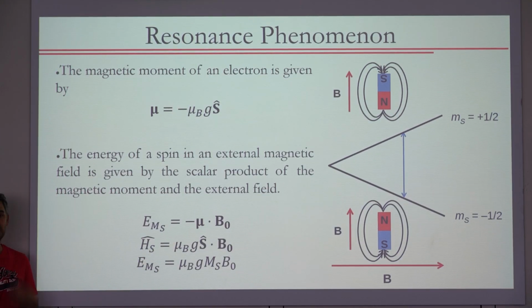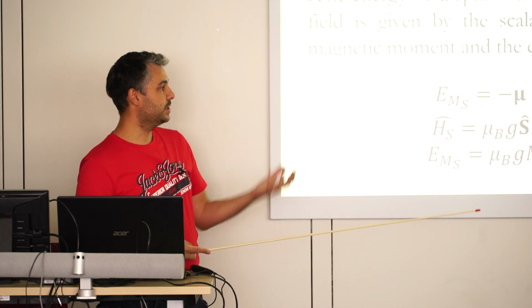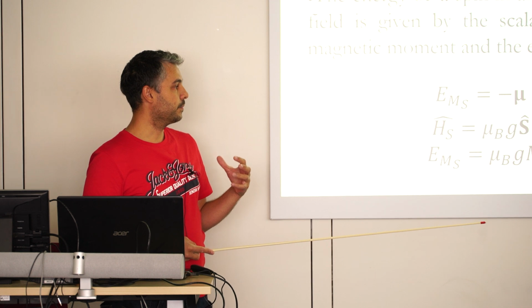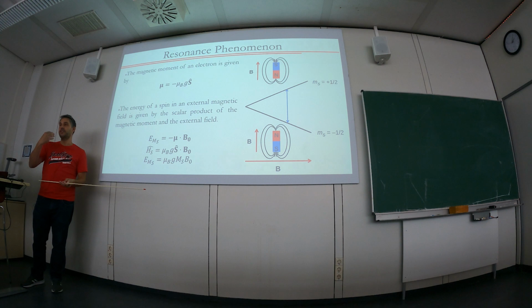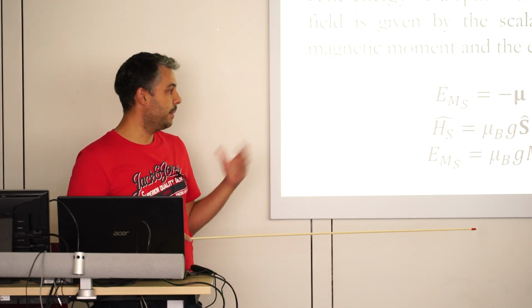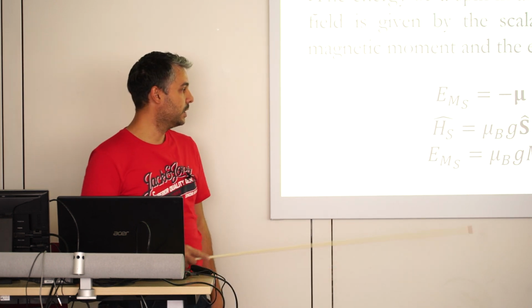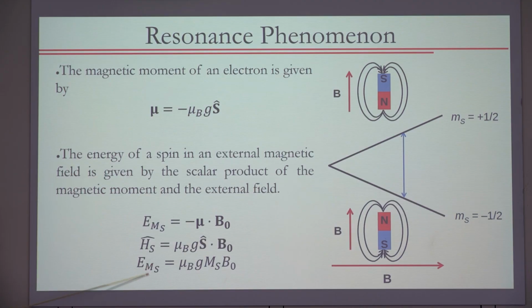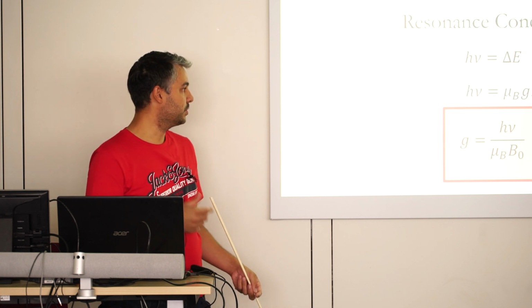A spin operator acts on the spin variables of an electron or a set of electrons and produces their eigenvalues and eigenvectors. Basically the different spin states each have a spin value, Ms equals plus or minus 1/2, for example. That's for a single electron. So you can calculate the energy levels that depend on the Ms value. So far so good. I think that's all basic, covering most of the physical chemistry and spectroscopy material.